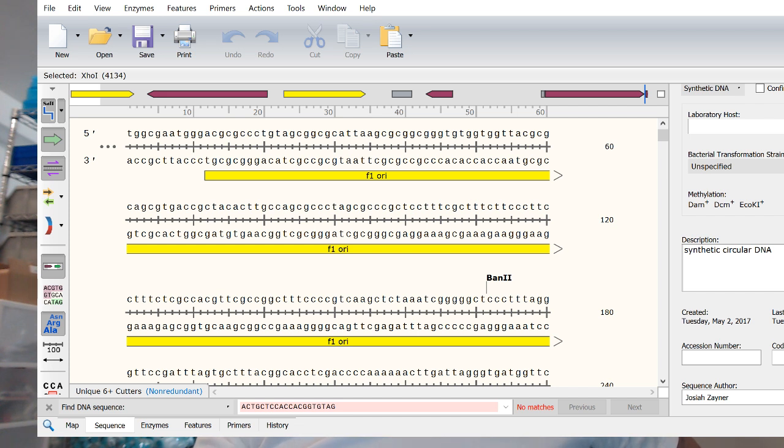So the plasmids on the Google Classroom should be bioinformatics material PD underscore GFP and bioinformatics material ProK1 EGFP. So we're going to look at the ProK1 EGFP sequence. So download that sequence and open it up in SnapGene.